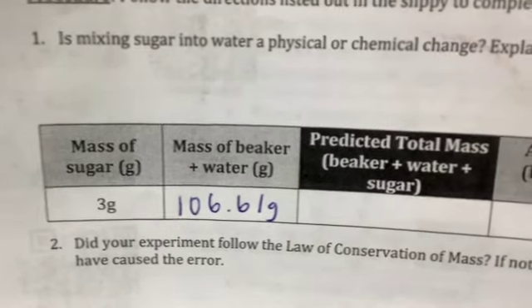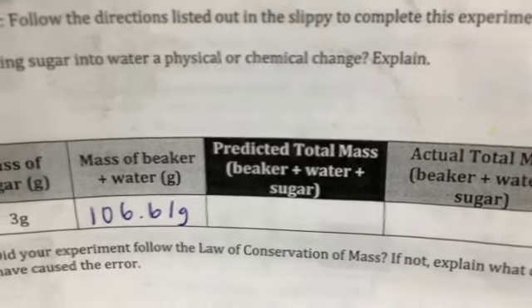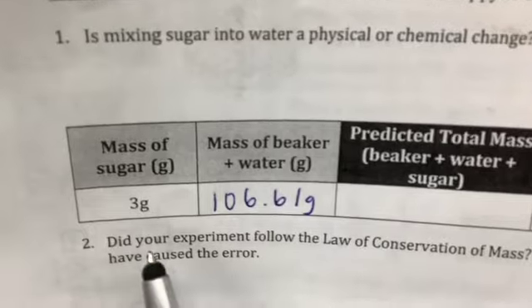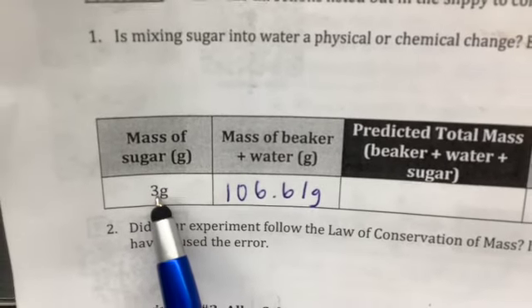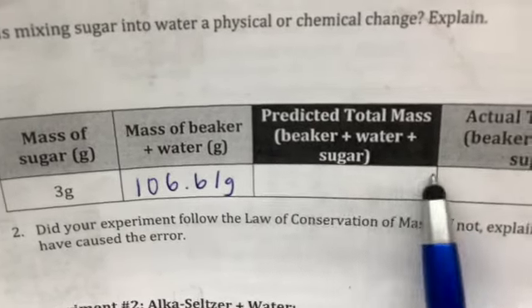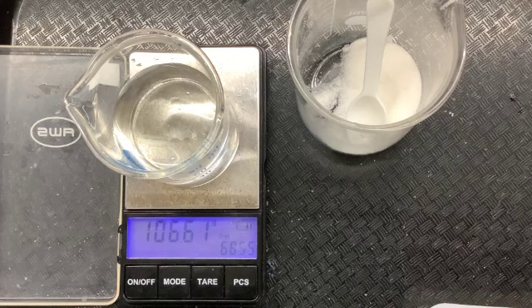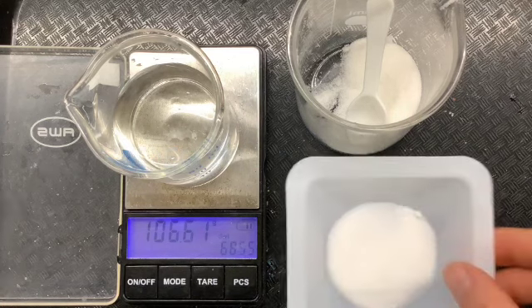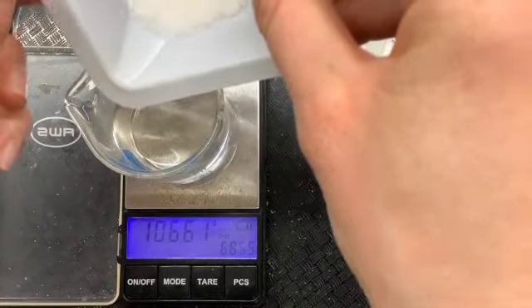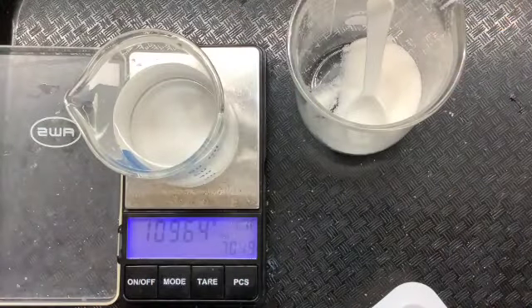All right, next, we are going to predict the total mass of the beaker plus the water plus the sugar. Well, according to the law of conservation of mass, it's probably going to be 3 grams plus 106.61. So write your predicted total mass in right now. All right, and then we are going to actually weigh our sugar. We have 3 grams of sugar here after we've poured it into our beaker. Make sure we got everything in there. We're going to stir it up until it's dissolved.